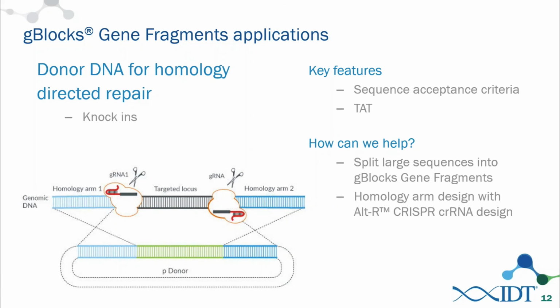So it's something we haven't really done a lot of work with yet, but internal modifications are particularly hard for us because they interfere with a lot of the tools that we use to enrich and select for sequences that lack any errors in them. So that unfortunately is a limitation that we have with gBlocks.